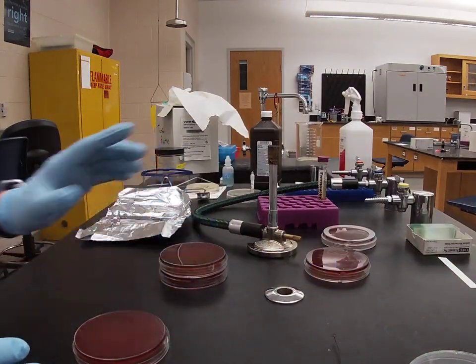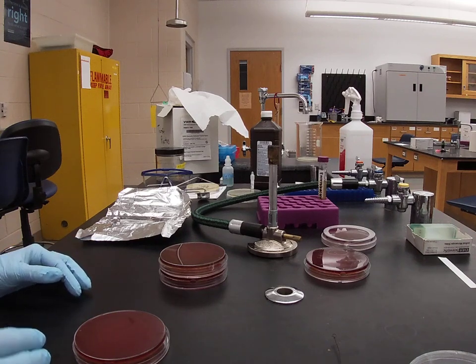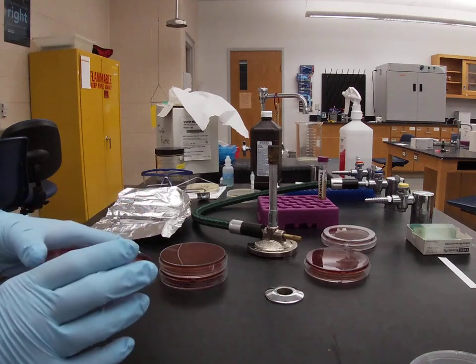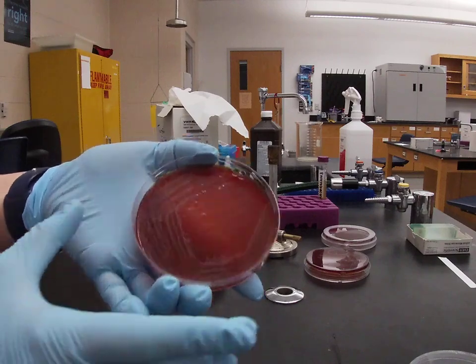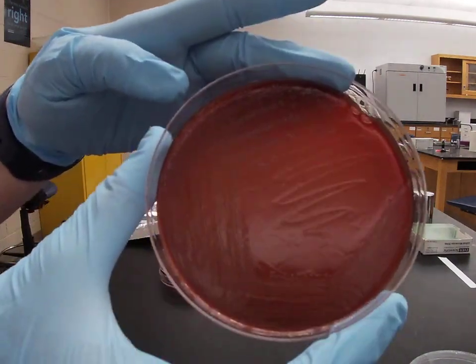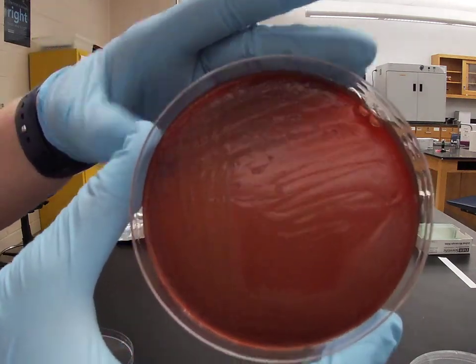And the third type of hemolysis is gamma hemolysis. And gamma hemolysis is actually no hemolysis. Organisms that have gamma hemolysis are not able to lyse red blood cells at all. And so with gamma hemolysis, when you look at the blood agar, you can see the bacteria growing on the agar, but there is no color change to the media, there is no clearing. You can just see the colonies on the agar themselves.